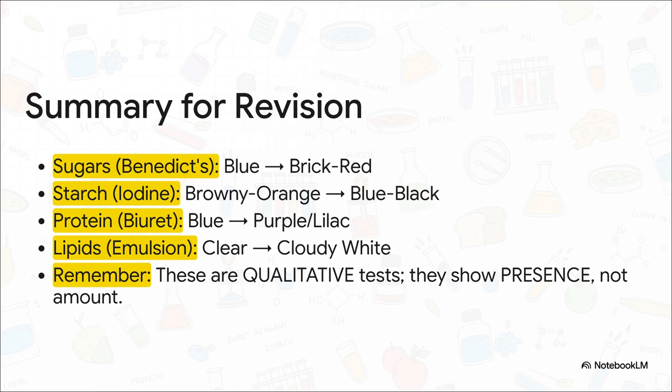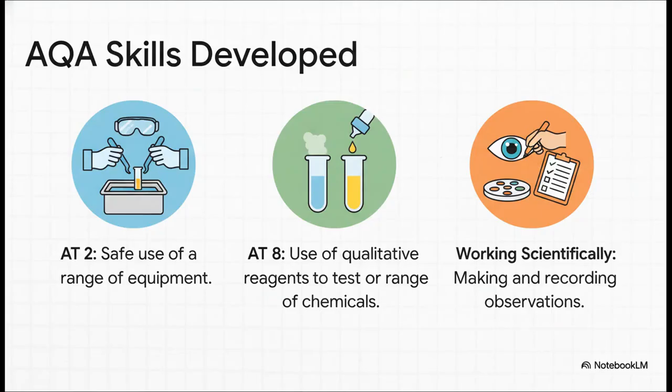And the final, major point, remember, these are all qualitative tests. They only show if something is there, not how much of it. And finally, just remember that in an exam, they're not only testing your memory. This practical is designed to test your actual skills. The AQA spec says that by doing these food tests, you're showing you can safely use equipment like water baths, that you know how to use these qualitative reagents properly, and that you can make and record accurate observations.